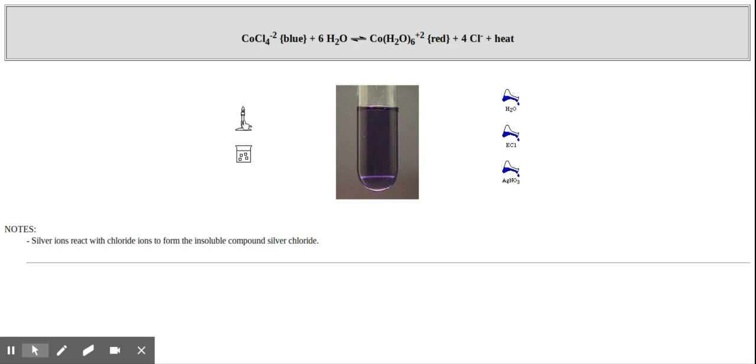So if you click on the heat thing, this comes up. Now this is the original equilibrium one, which was like a violet color, and then this is clearly more blue. Okay, and if it doesn't look like on the video, just look on your screen. All right, so this is clearly more blue, so what we would write in result, blue. Okay, so we were correct. And then you just go back and look at the other ones, and then it tells you what to do.